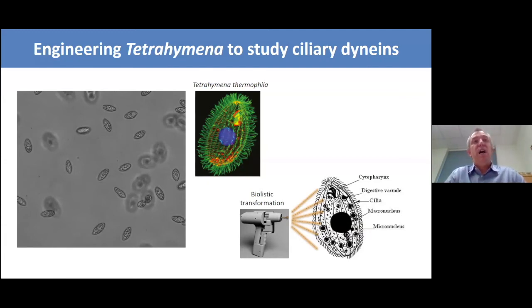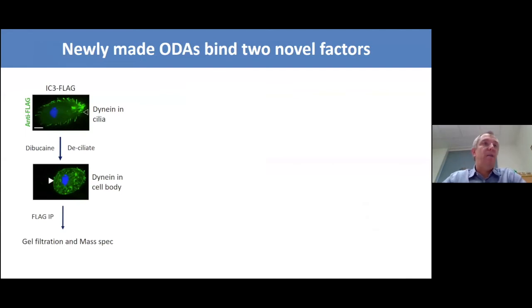So in order to do homologous recombination, you introduce your DNA, but then you have to select for quite a time to slowly replace all the copies, from 1 up towards 45 copies replaced. So the way that we approached this project was to make a tagged intermediate chain.